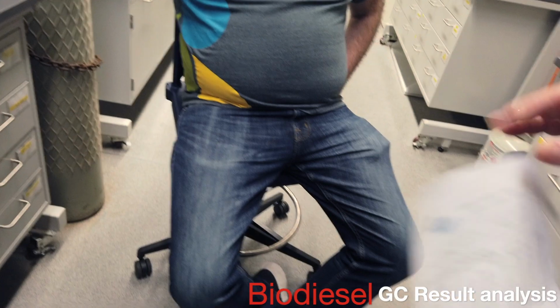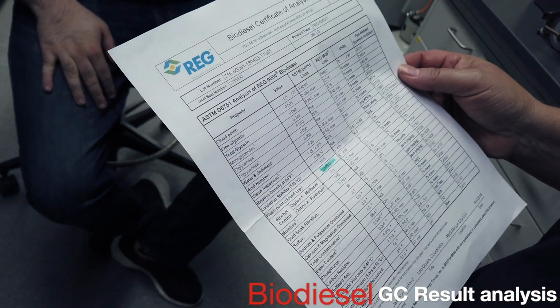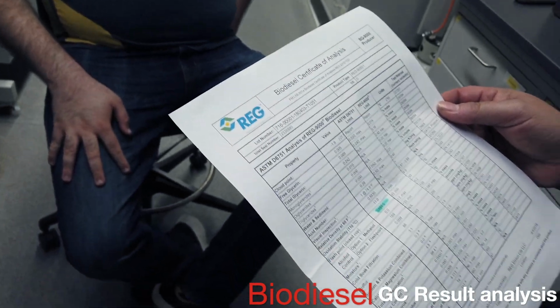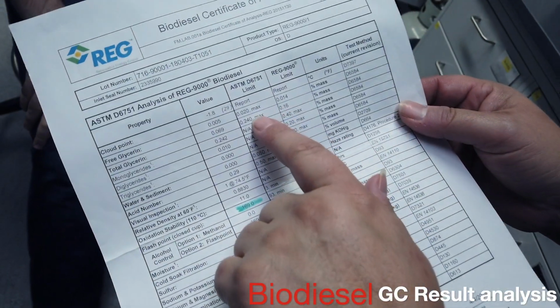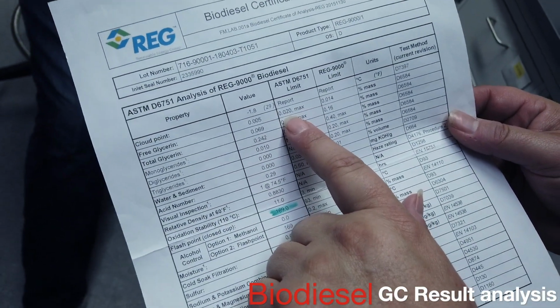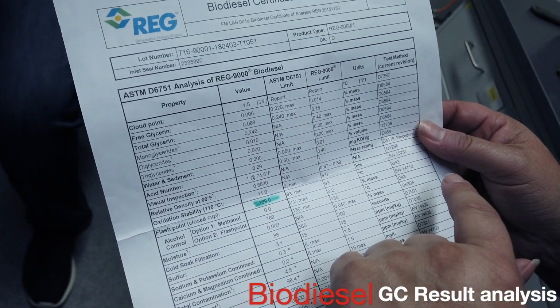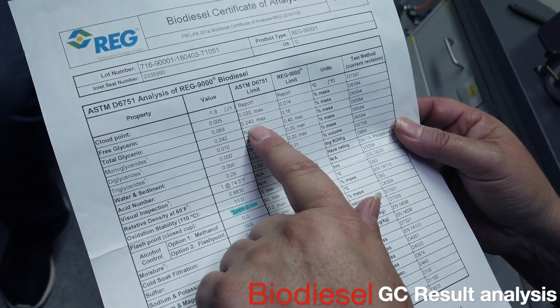That's the only thing about this, is that you have to manually calculate total glycerin, because that's a calculation. But it gives you the calculation in the method, right? Yes, in the method. So here the limit for free glycerin is 0.02 max, and for total glycerin is 0.24.